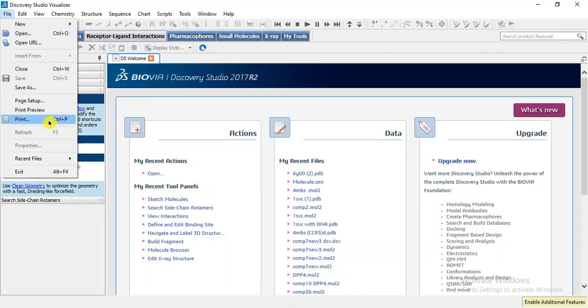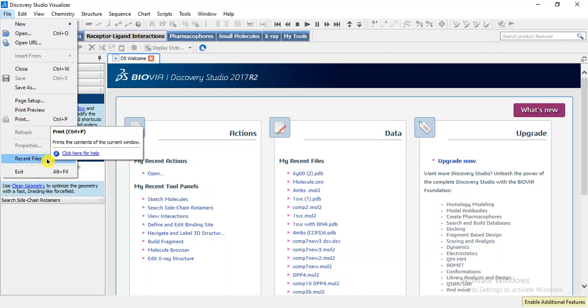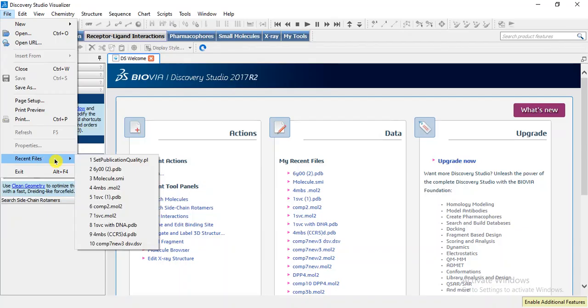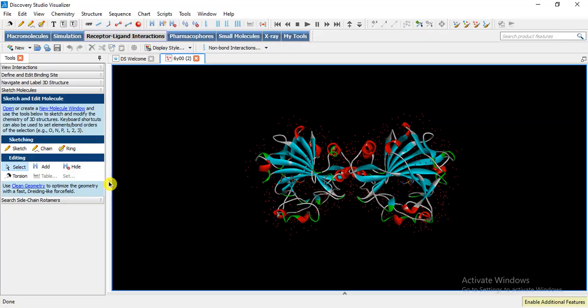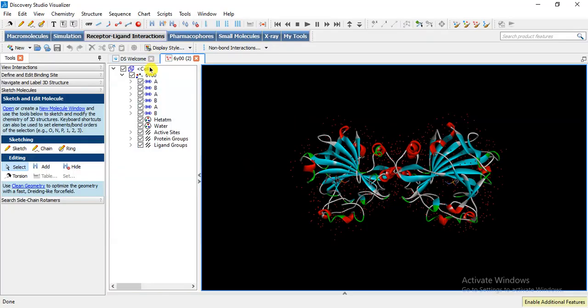I am going to take a recent file that we observed in our previous lecture. This is our carbonic anhydrase 2 6Y00. This hierarchy represents that it contains two chains A and B with ligands and water molecules. Now I am going to take only chain A.